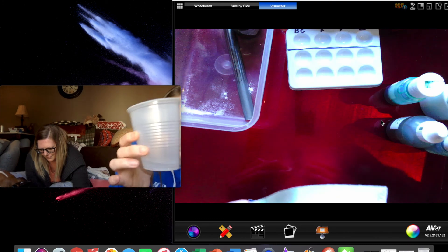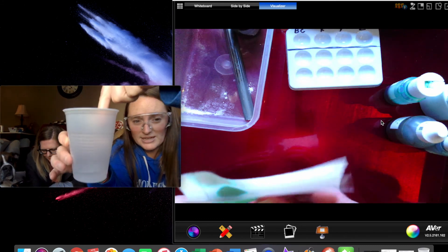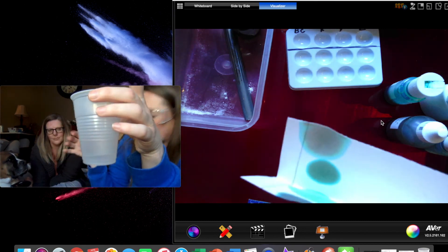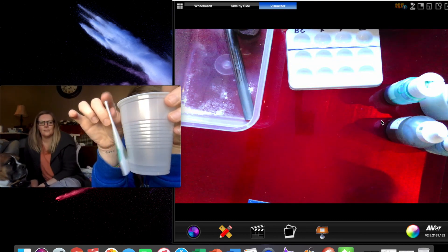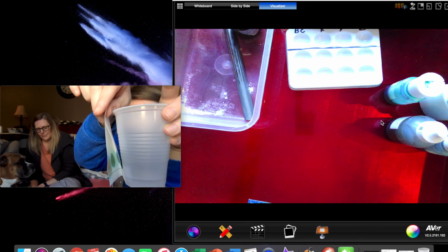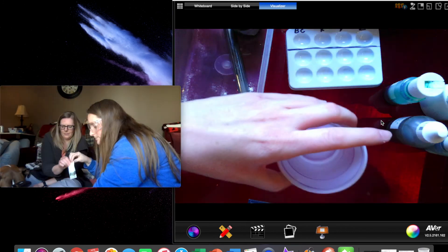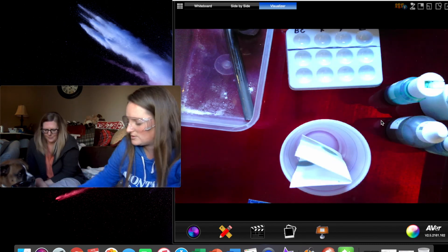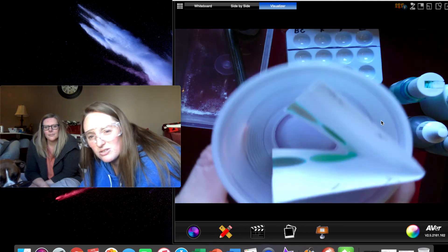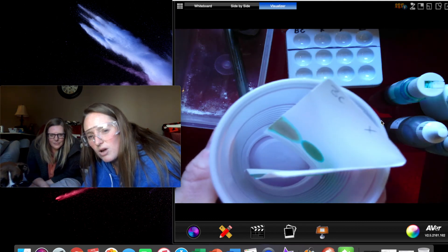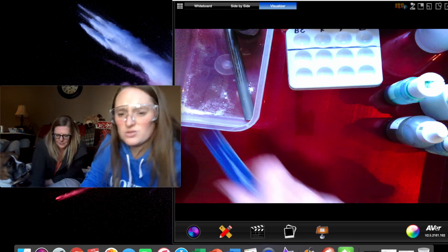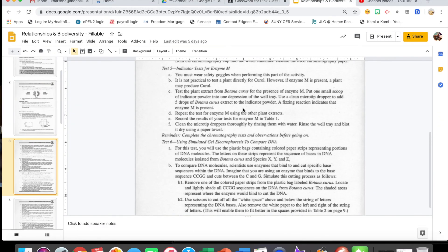We also have a little cup of water. The key is we're going to put the paper down into the cup, and we want the water level to be lower than the pencil line. Jen is going to put the paper into the cup — it'll stand up, which is why we fold it. We'll put this off to the side; you can already see the water starting to soak up the paper. We'll come back and read it in a few minutes.